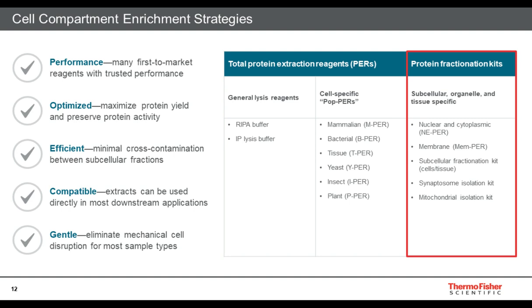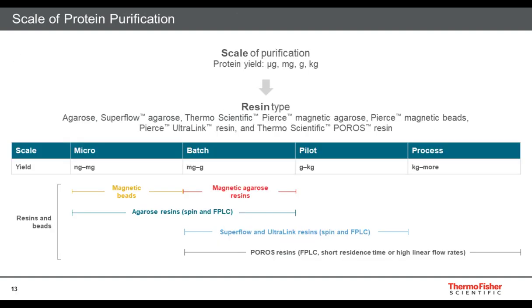Alternatively, there are buffers and formulations that enable nuclear cytoplasmic fractionation, membrane protein enrichment, or other subcell fractionation, providing methods to enrich for protein classes or particular cellular locations. The extraction buffer that I will discuss later in this talk that was used to solubilize GPCRs has characteristics of both types of lysate buffers, in that it results in essentially the production of a whole cell lysate, but it is specialized as well in that it is able to stabilize a certain subset of proteins, the GPCRs.